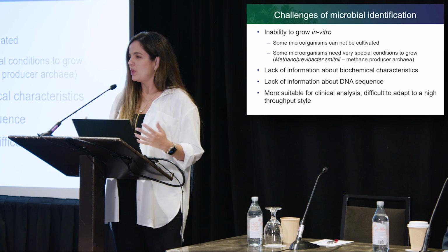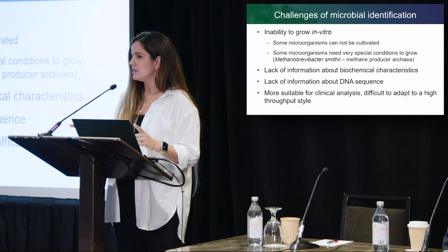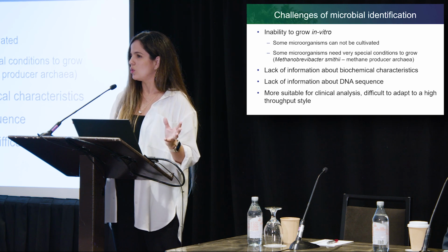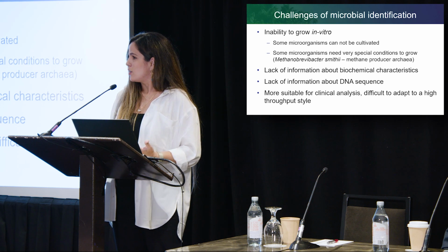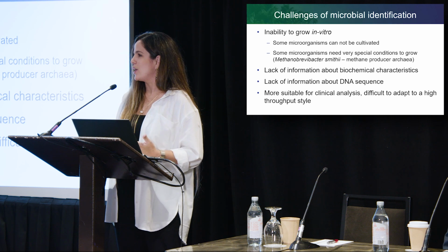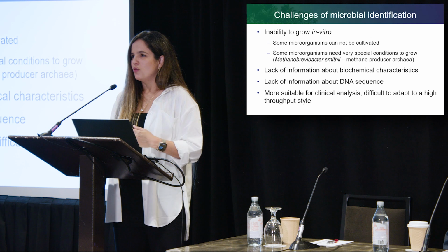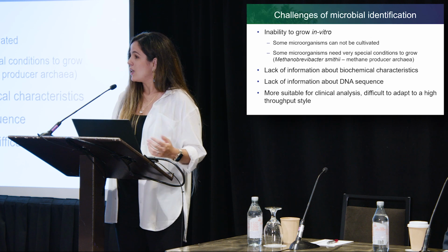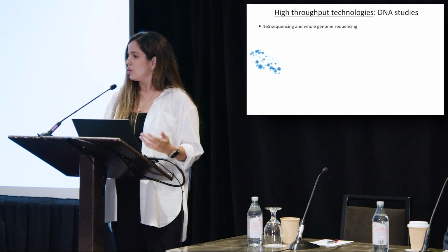Right? So instead of studying single microbes, although we apply these techniques to diagnose SIBO and SIFO, we apply cutting-edge, high-throughput technologies to study every single microbe in a sample. So we are not isolating one, we are isolating all of them at the same time. And how do we do that? I will walk you through this process.